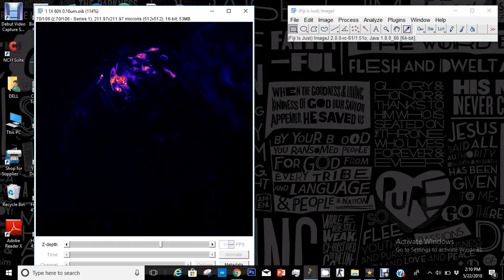Now, I didn't take a particular plane to count the cells; instead I took a stack. The reason being, simply, all these cells are not in a plane. In some cases like cell culture, the cells are like a monolayer on a plate, so in that situation taking one plane would help.